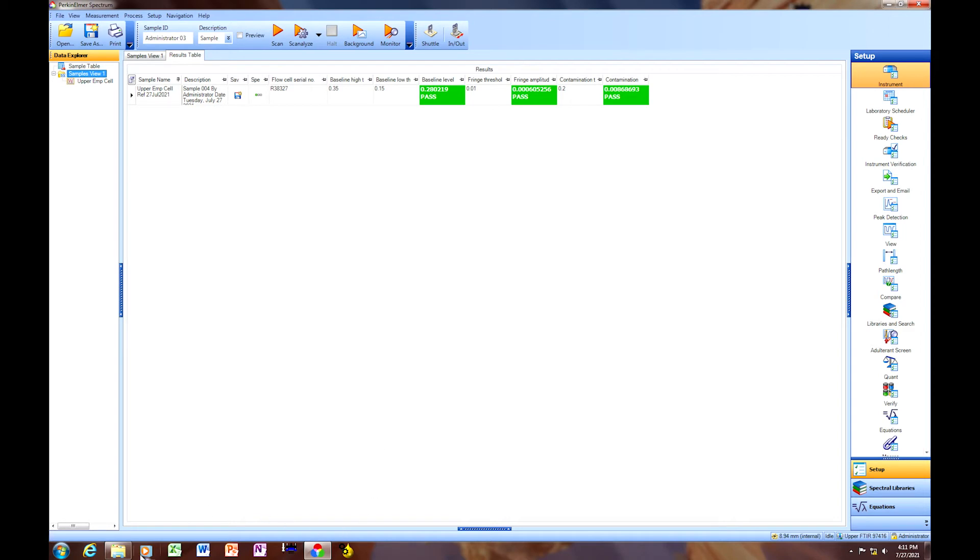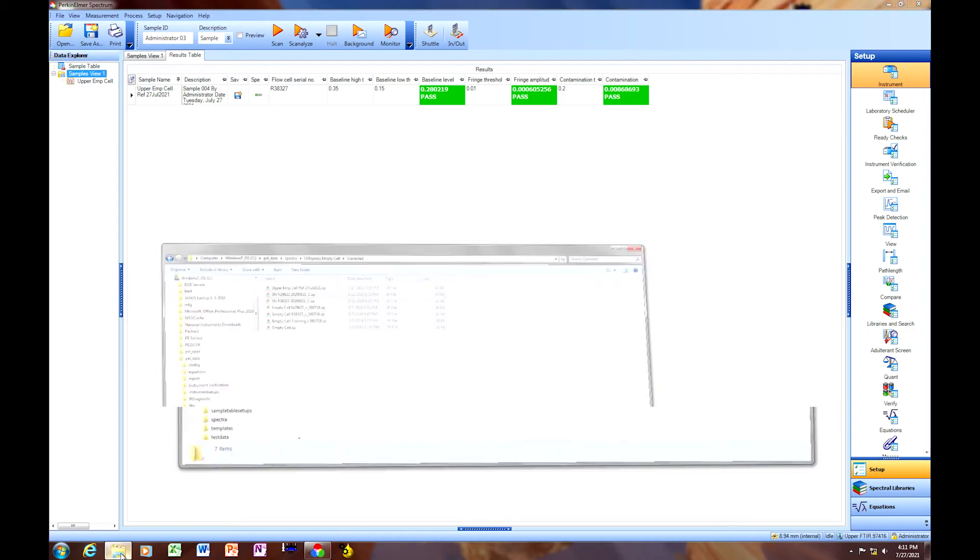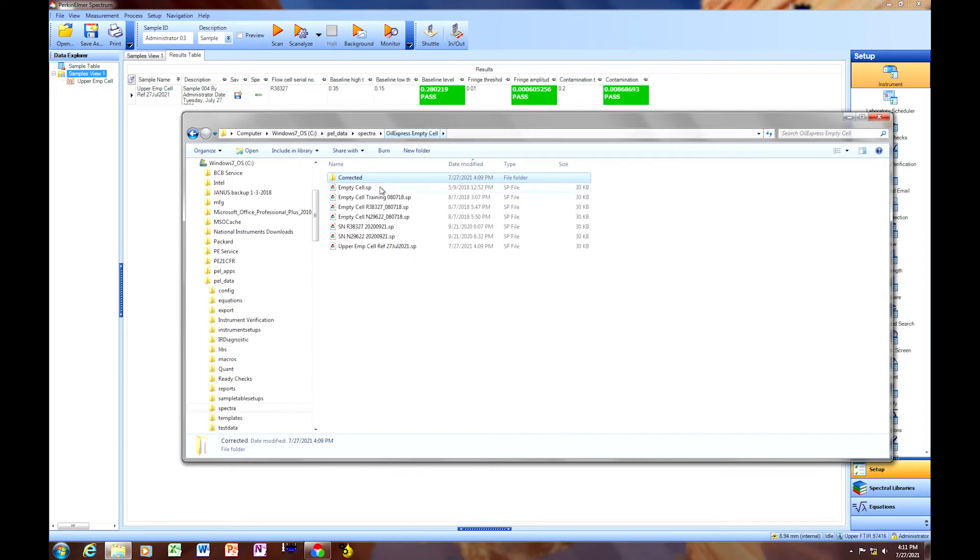Now one thing that I like to do is navigate to the location of the empty cell reference spectrum, and or spectra. And it's under pel_data, spectra, OilExpress, empty cell. So we'll start there.